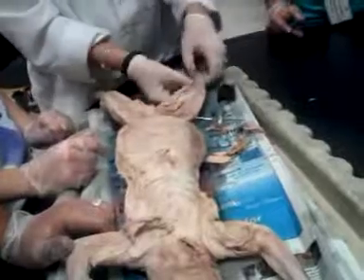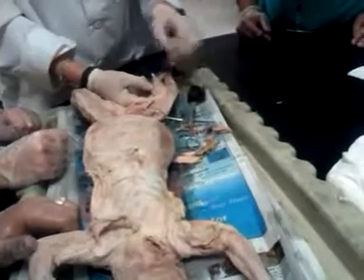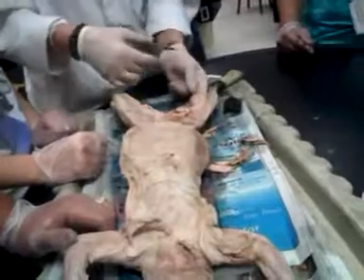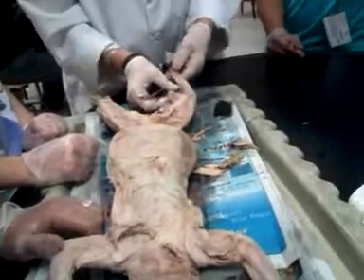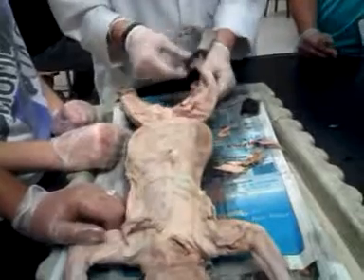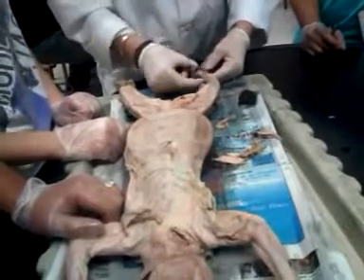That's not a muscle. Yeah, guess what this muscle is? Gastrocnemius. Okay, that's your gastro. Look at that, what a great muscle. Boy, I'd eat that. But guys, I'm telling you, people are like, oh, it's a cat. But this is exactly like a horse or a cow or a chicken, or human. Okay, here's your soleus. See right there?